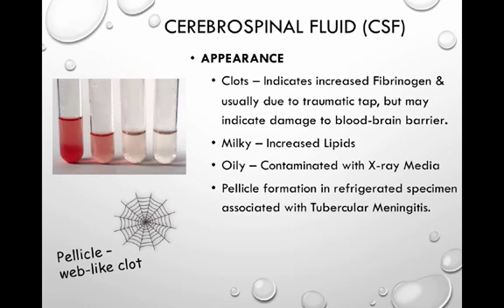We also can have pellicle formations or web-like clots, and that can form following refrigeration. It is also seen in tubercular meningitis as well.